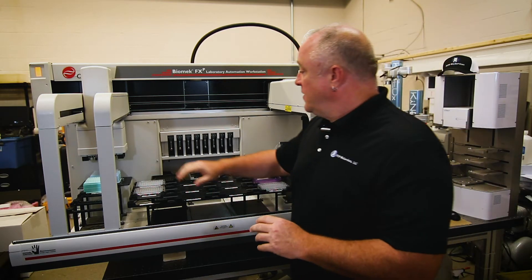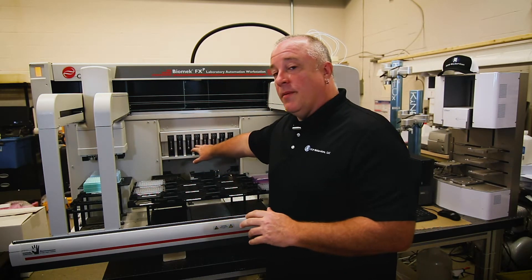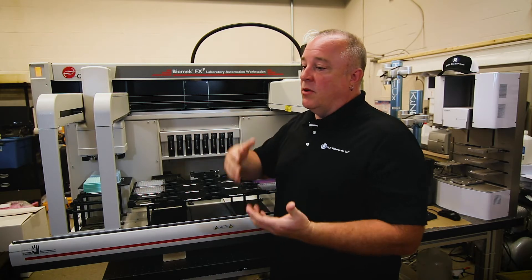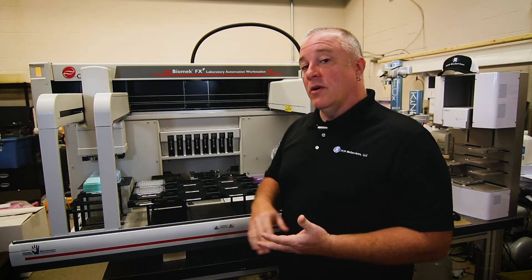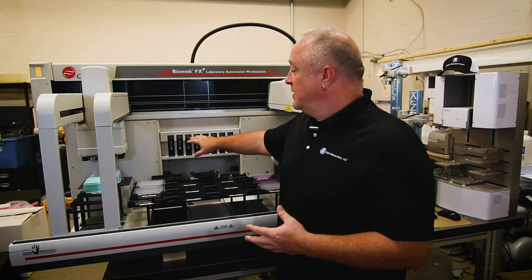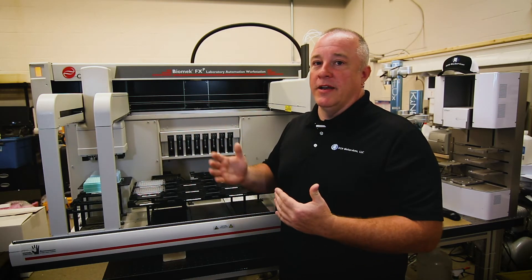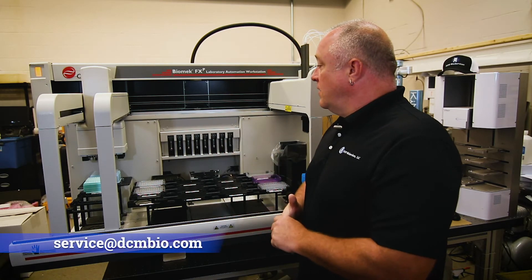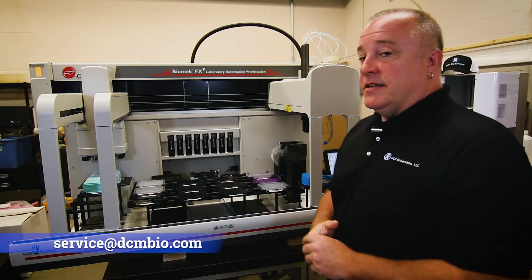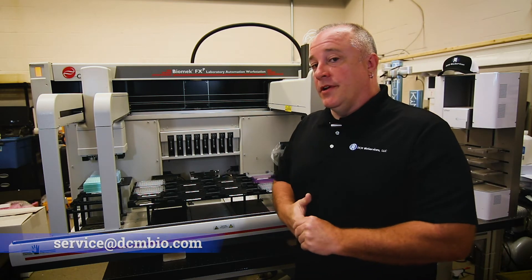Another thing I wanted to mention is if you have different syringe types — we have 1ml syringes — if you have the lower volume ones like the 250s or the 500s, you may have to let it purge a little more, because these will only purge 1ml at a time, or 250 or whatever syringe type that you have. So go ahead and let it purge for longer. Make sure all the air is out of the system and you should be good to go.